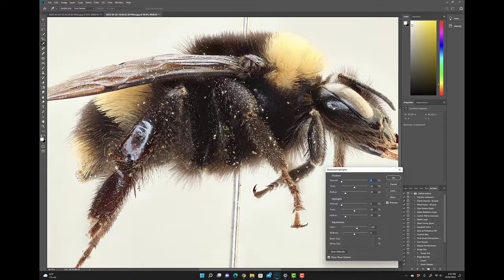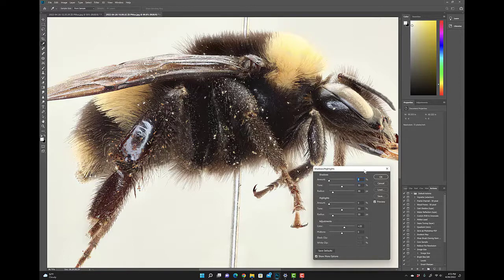It's going to be dark and hairy, and those hairs are going to reveal or basically hide anything that's behind it, just like it would if you were photographing a dog. You photograph the hairs because that's in the foreground. It's what you see. Even though humans have significantly less hair in some people, hair, again, is what you see. So just keep that in mind if you're trying to really get through the hair and see features that maybe, again, you don't really need to reveal.